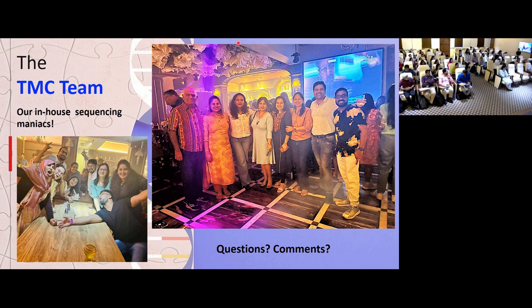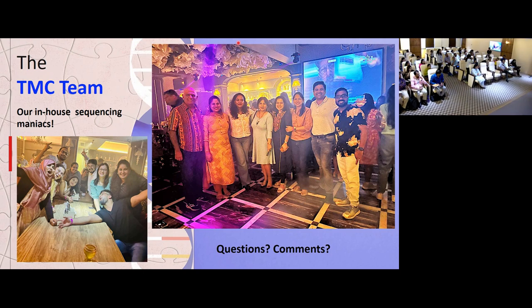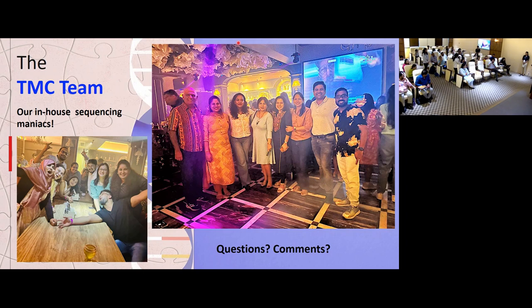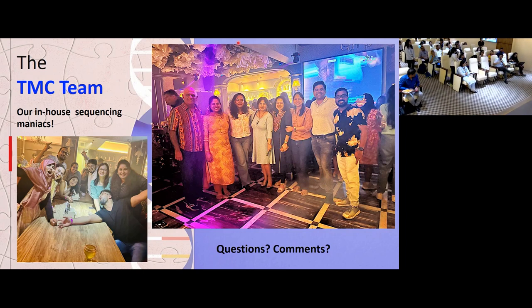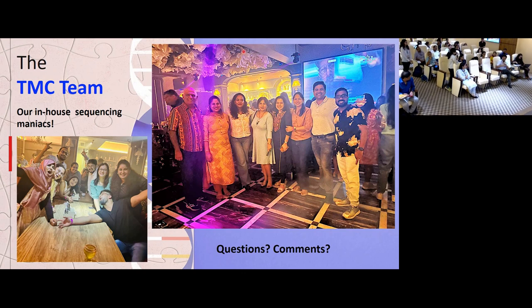What I came to know, sir, is that the wax clogs the pores. So impure DNA. We are seeing this in stool samples as well. If there are impurities present in the DNA, it will block the pores, and suddenly it will show pore availability drop. Yes. Thank you, sir.